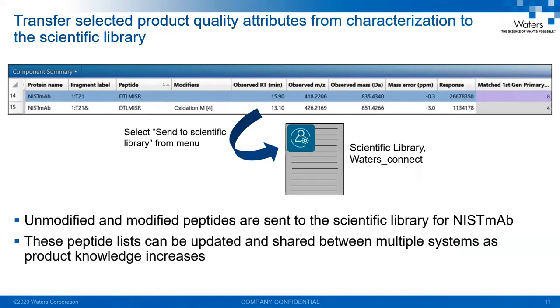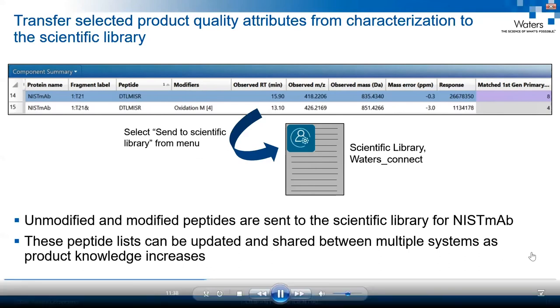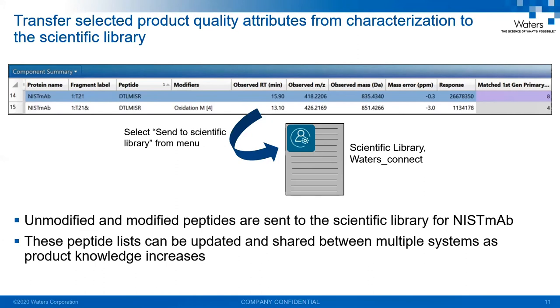Once we finish processing data in the peptide mapping method, we get a table showing the two forms of the Miso peptide — unmodified and oxidized. Scientific library creation is a one-step process: highlight the two forms, right-click, and select 'send to scientific library,' which automatically creates the library. When it creates the scientific library, it stores all detection information including the sequence, modification levels, retention times, mass-to-charge ratios, charge state information, and fragmentation data. A key feature is that it allows users to share libraries between different user groups and systems, and update the library over time.